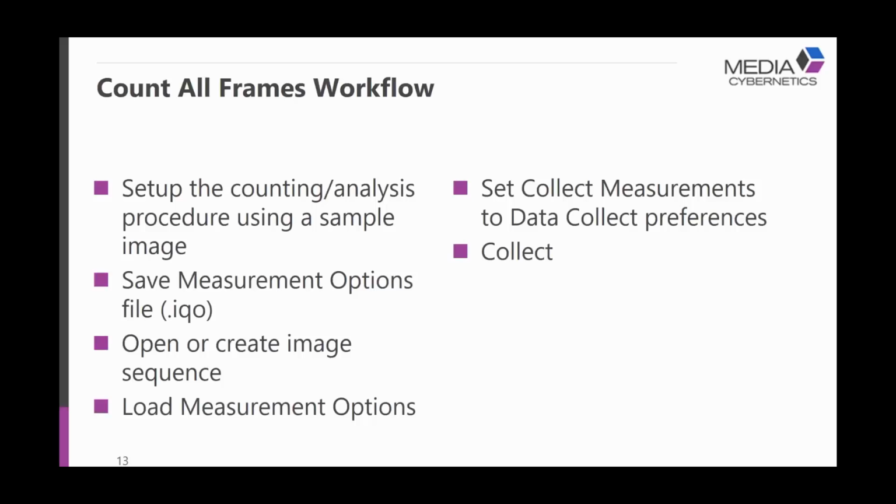Motion tracking, there's one. In manual measurements, there's one. There's also one in image histogram, and there's a few others. But any place that we're actually generating data, we will have that count button. You'll see this live again as a reminder. From there, we'll set up the preferences about how you want to collect the data, and then we'll collect it. We'll go through and automatically analyze all of the images.